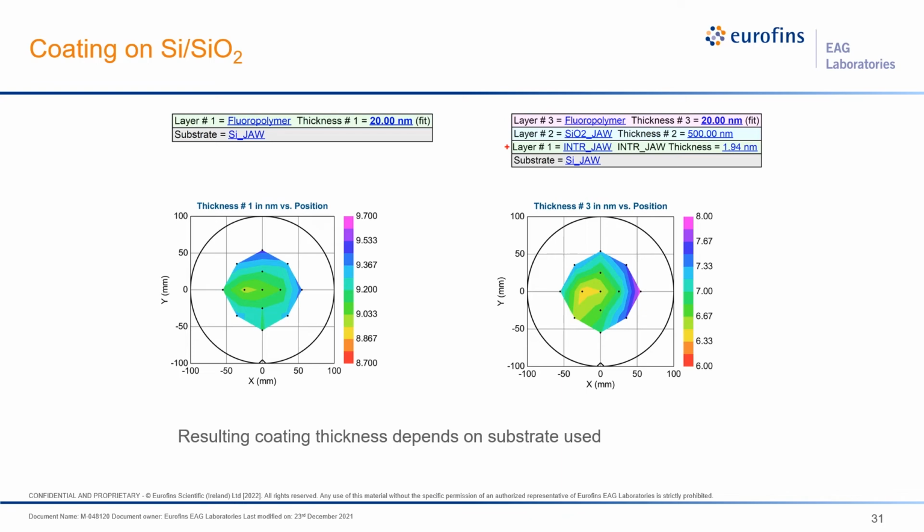It emerged that the thickness of the film is slightly larger at around 9 nanometers when deposited directly on silicon as compared to the thickness of around 7 nanometers when deposited on the thermal oxide.